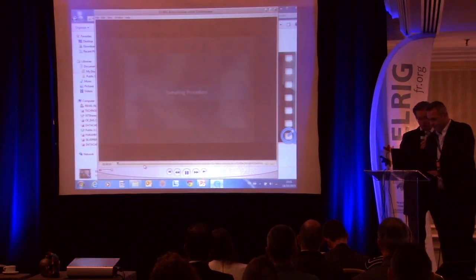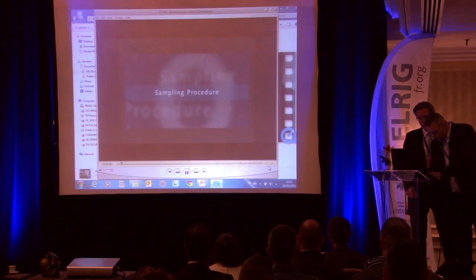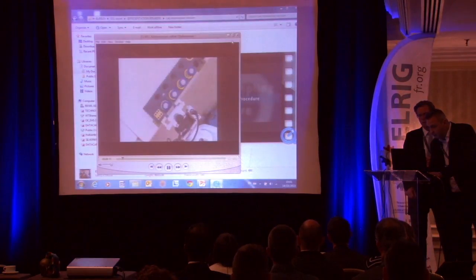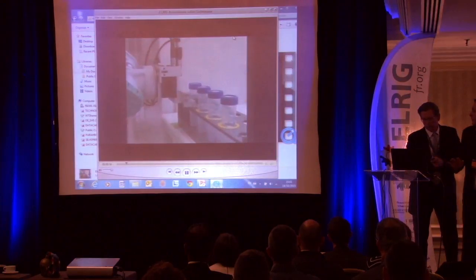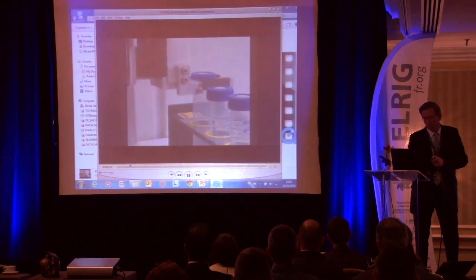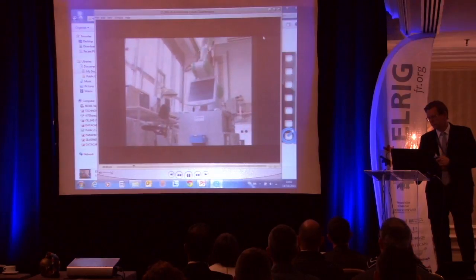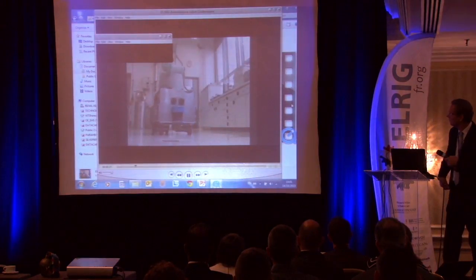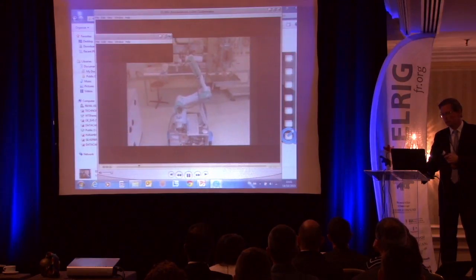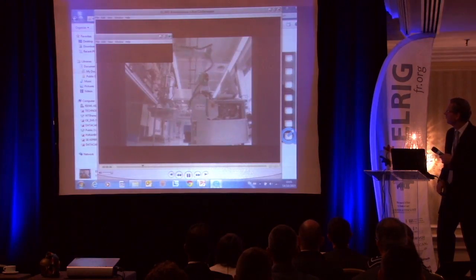The following sampling procedure is just an example sequence. It can be modified at any time for performing other tasks in different laboratory setups. Fine positioning is also achieved through the marker. Distance and orientation of the object in relation to the marker is known. Therefore, an object can be safely grasped upon completion of the fine positioning routine. All operations are under the control of the force torque sensor. The gripper moves down until it touches the upper rim of the rack. Once contact is made at the estimated height, the manipulation continues.